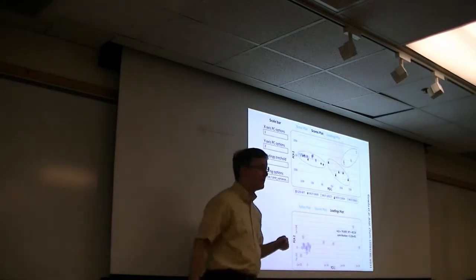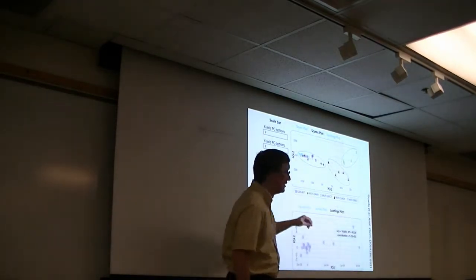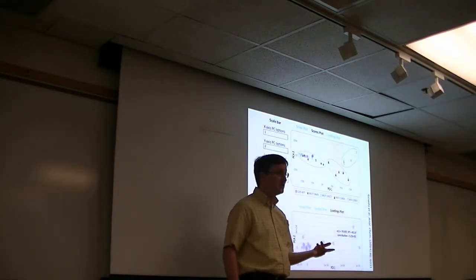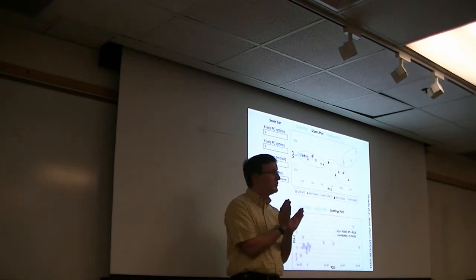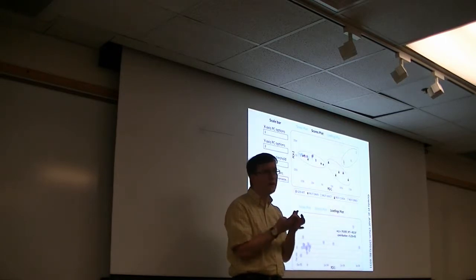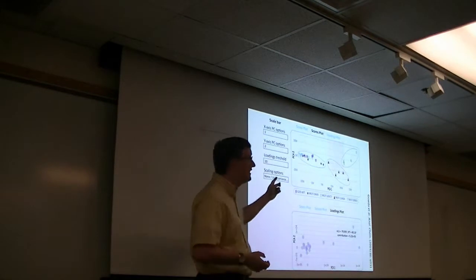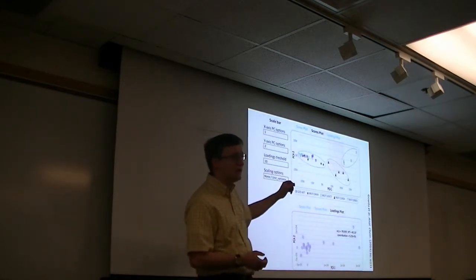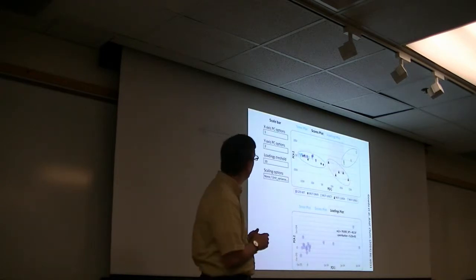So now we're looking at a principal components analysis of these data sets. Keep in mind what I was saying yesterday, that when you're looking at a principal components plot, you're almost always looking at just the first 2 components. Now, by definition, those first 2 components are the ones that account for the most variance in the experiment. So generally speaking, that's a good approximation. But you may yet have additional variation being accounted for by the 3rd principal component.